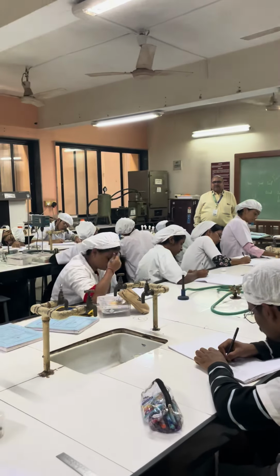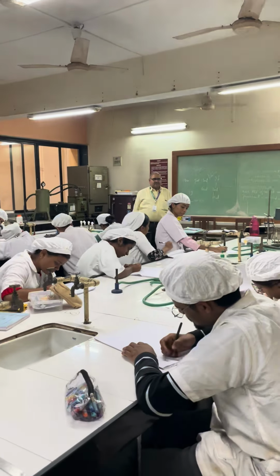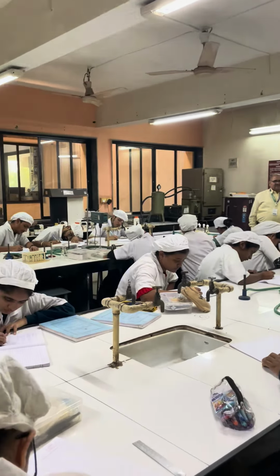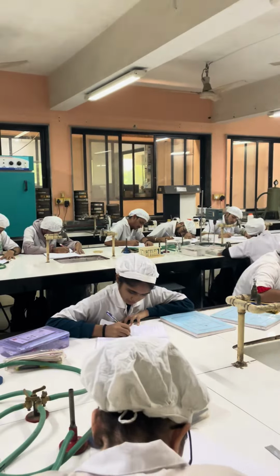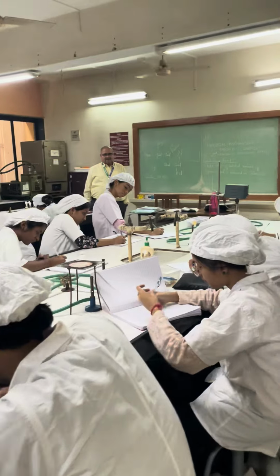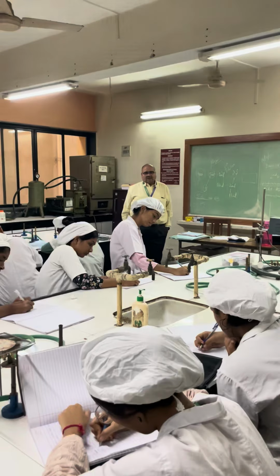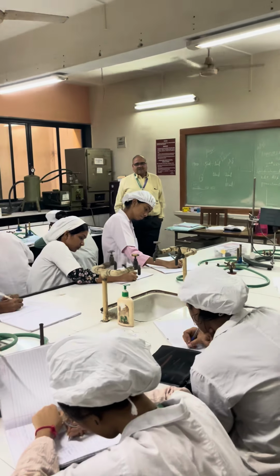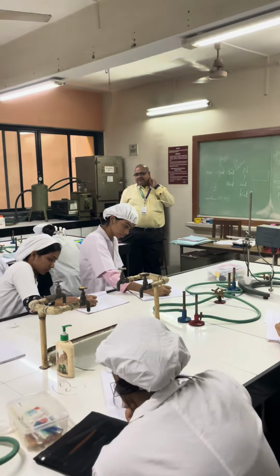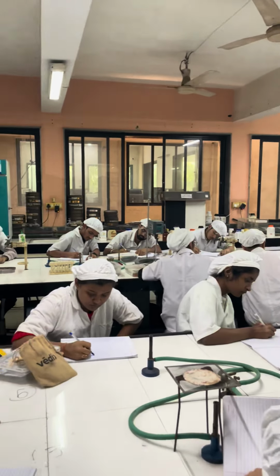After addition of water to all the test tubes, incubate all the test tubes at 37 degrees Celsius for 24 to 48 hours. After 48 hours of incubation, add to all these test tubes small strips of blue litmus paper.